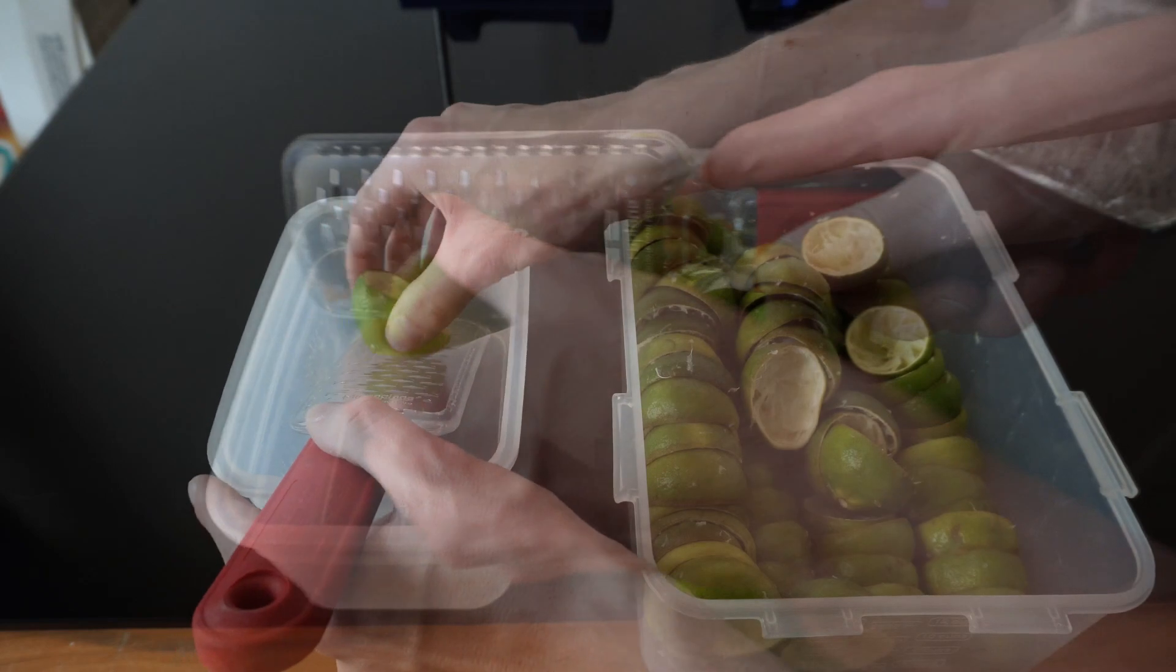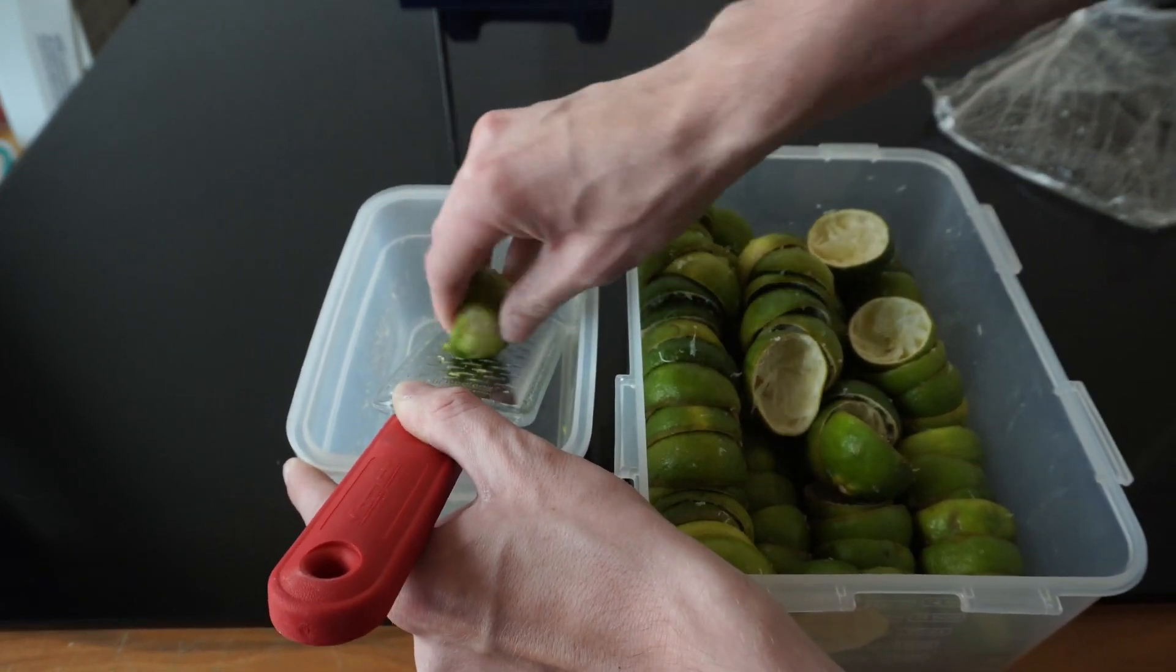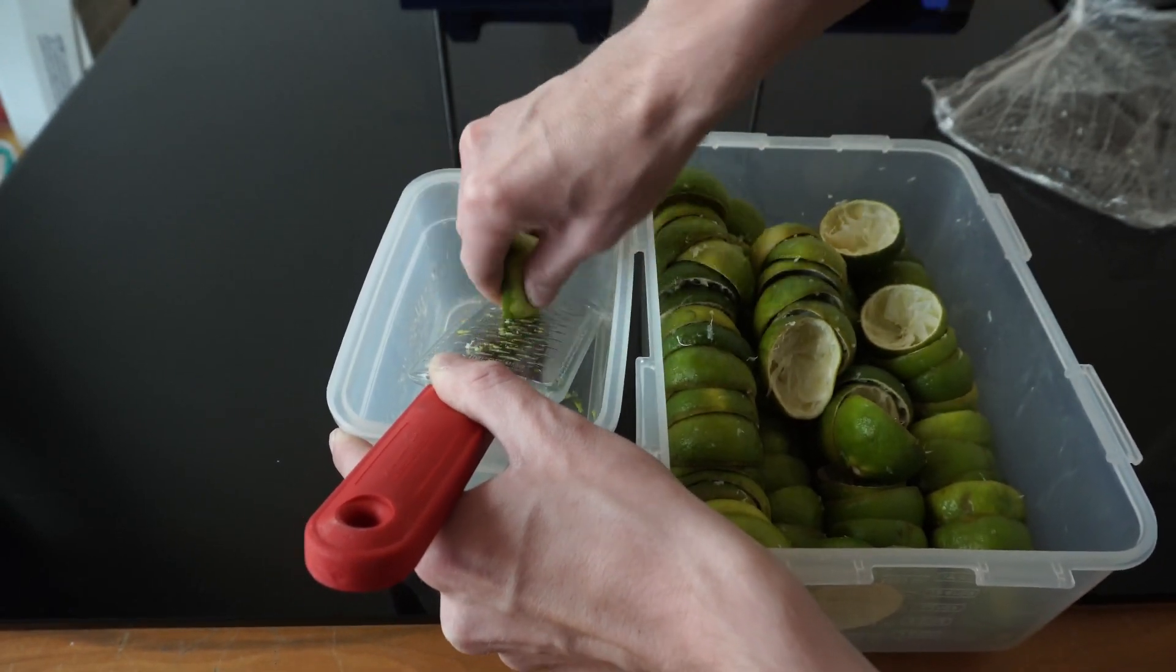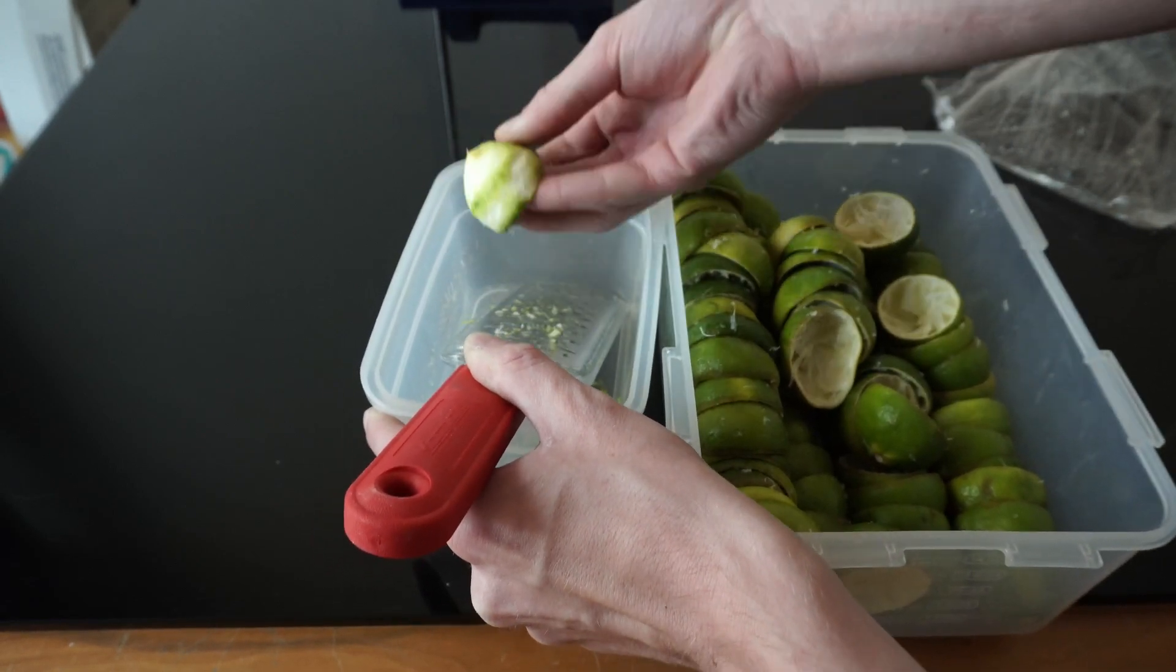We are going to be focusing on the part of the lime that contains the most limonene, which is the rind, or the skin of the lime. Even though there is limonene throughout the fruit, the most concentrated part is the skin, so that's what I'll focus on.